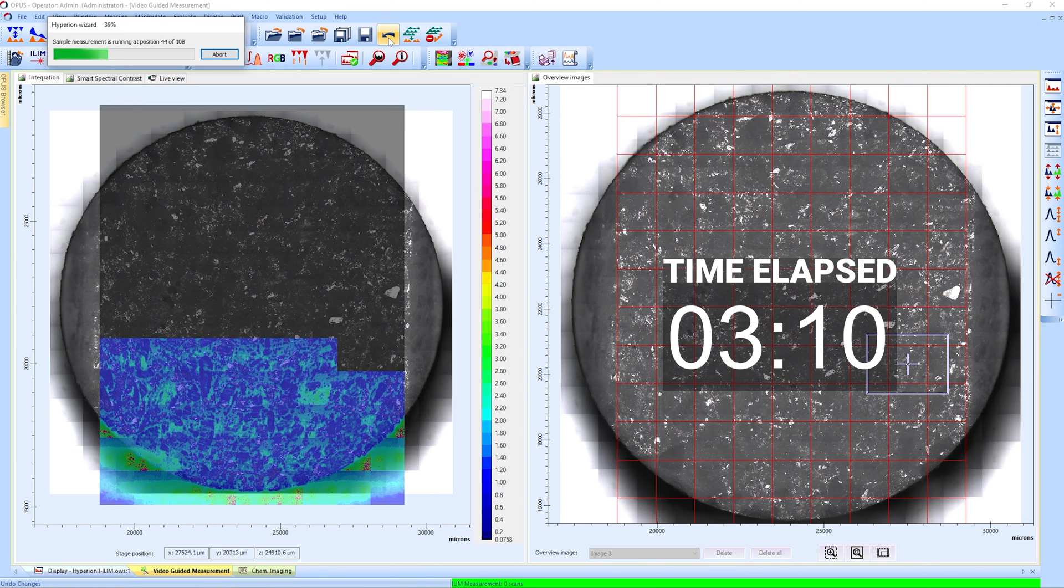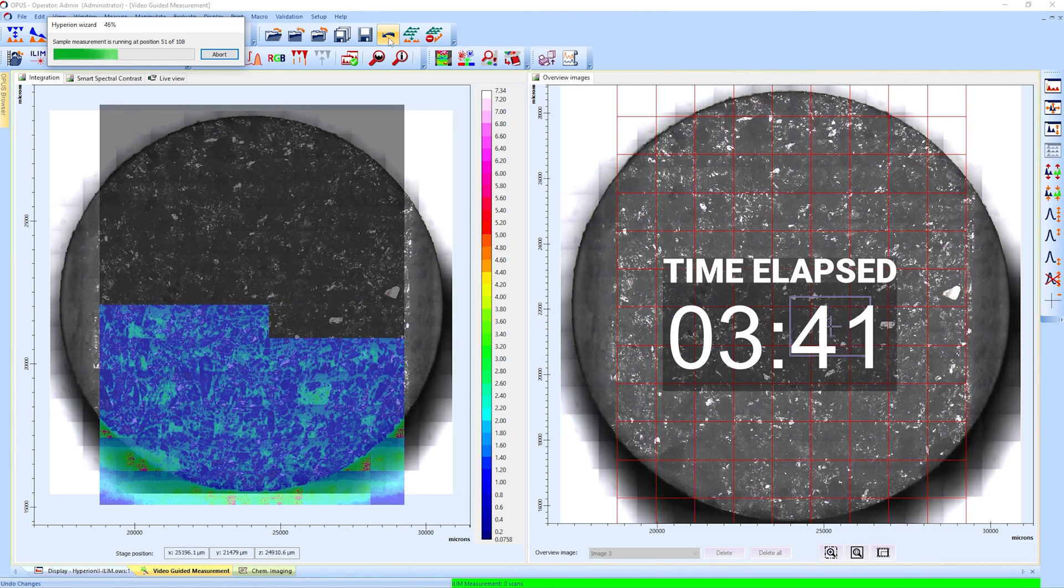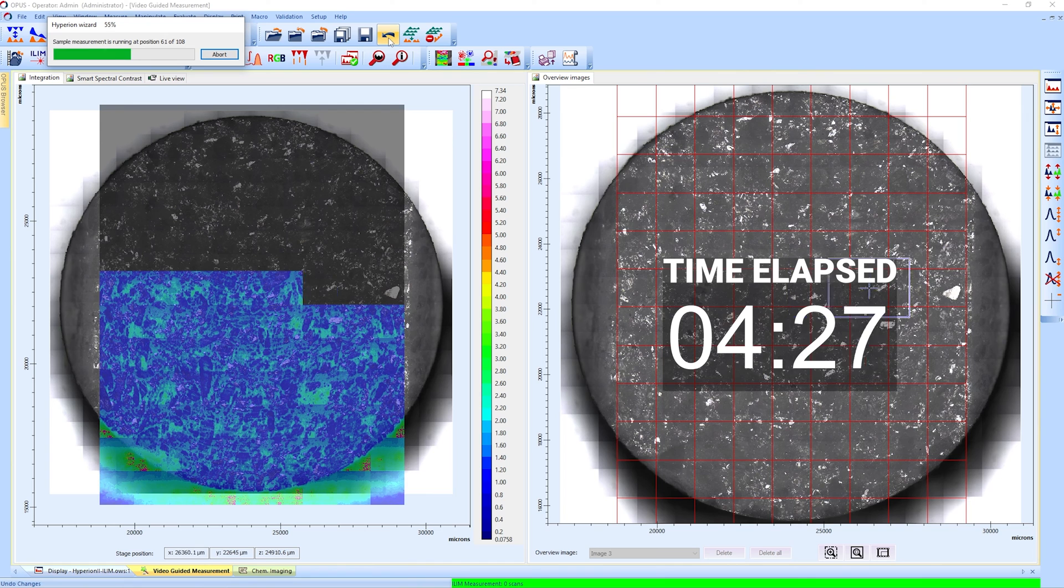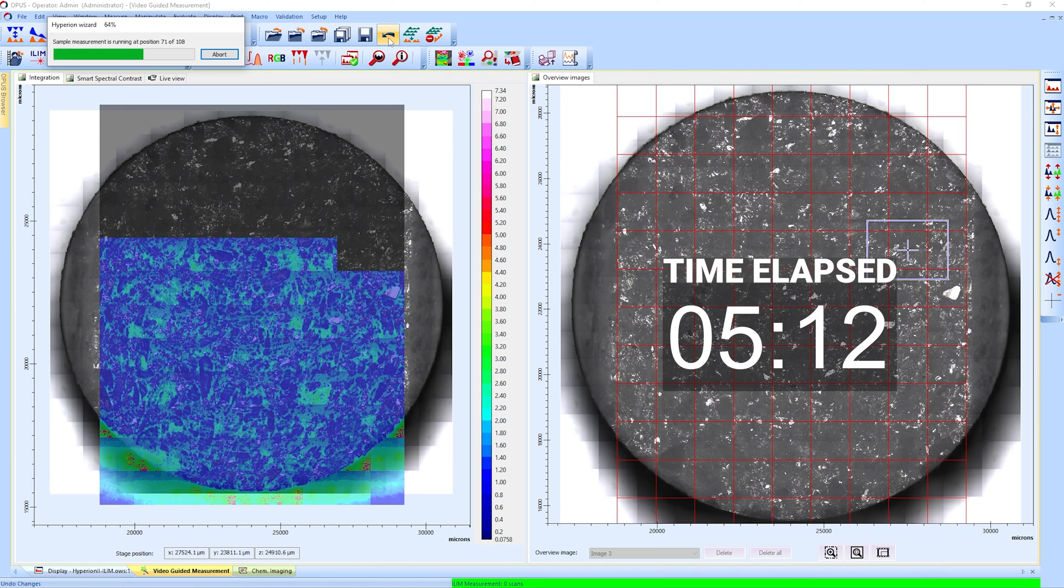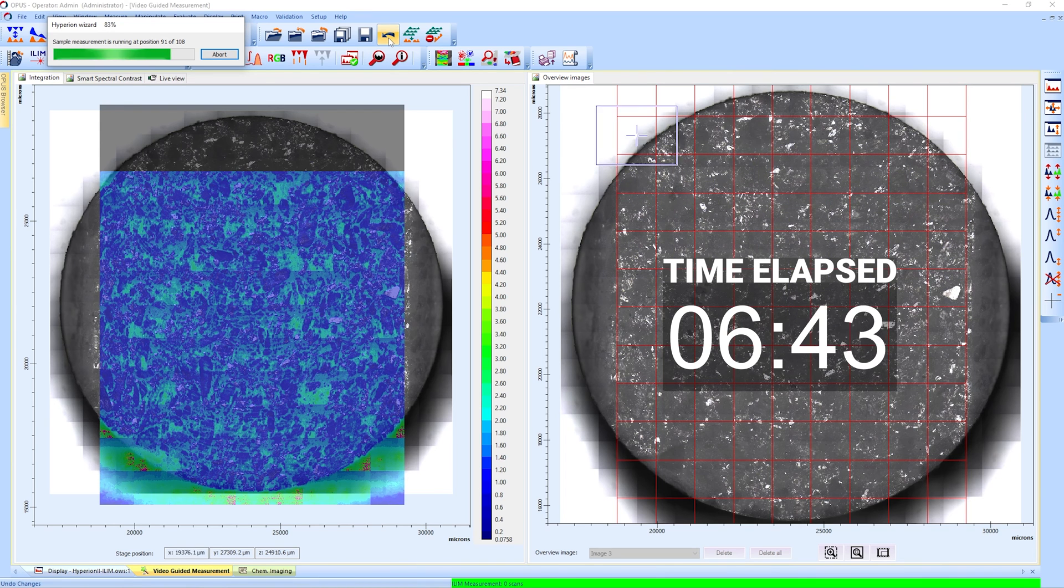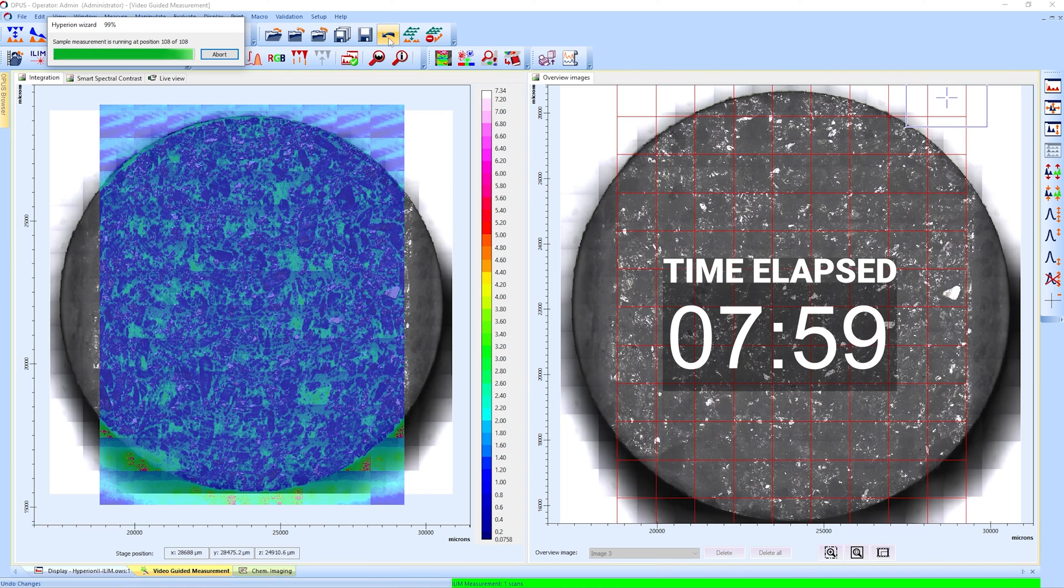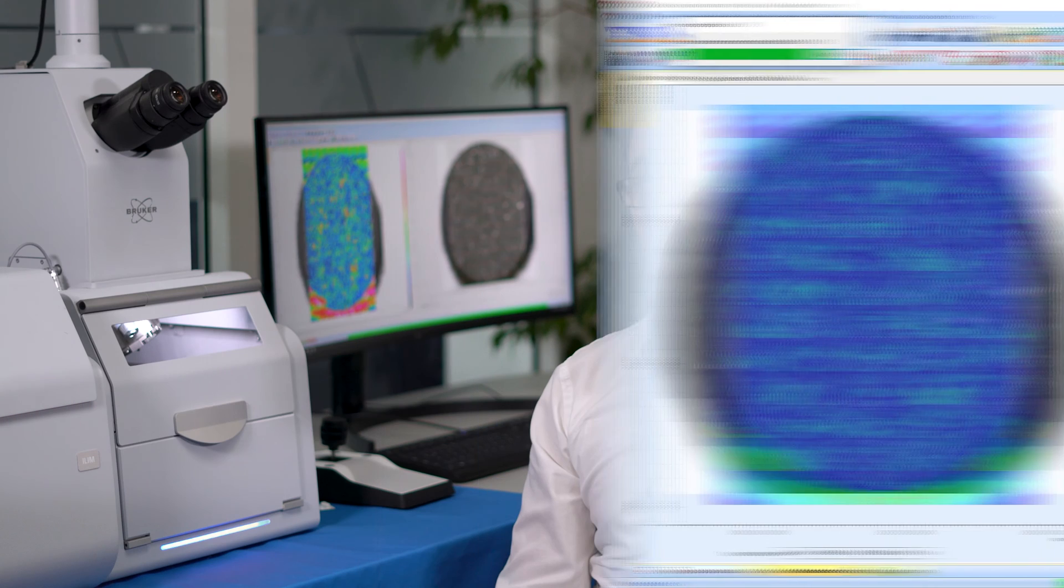Everything you have seen so far is in real time and completely unaltered. But let's speed things up and skip to the end of the measurement. Imaging this whole tablet of around 13 mm in size took only 10 minutes. Let that sink in.